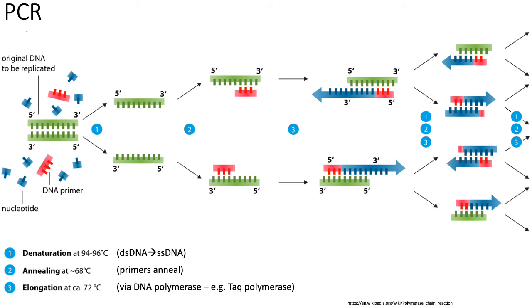Although everyone knows that PCR leads to an increase in bias in the representation of certain DNA fragments compared to others, it's oftentimes necessary, specifically for RNA sequencing, because if you're working with certain types of samples like FFPE samples, formalin-fixed samples, then you have very little RNA to begin with. A lot of these bulk assays need RNA from millions of cells. And so you need to use PCR in order to generate enough RNA, or in this case cDNA molecules, in order to properly sequence all the RNA in your samples.